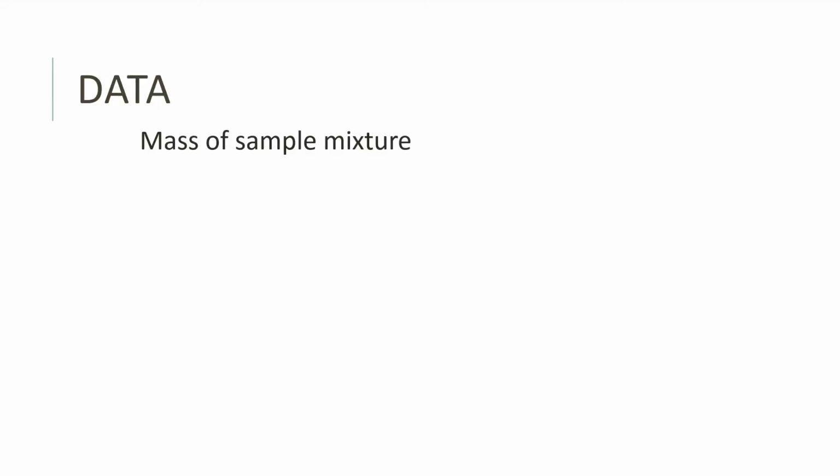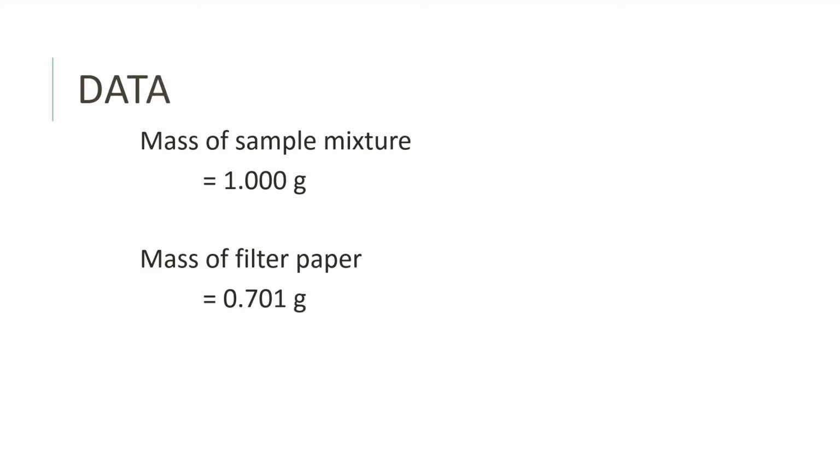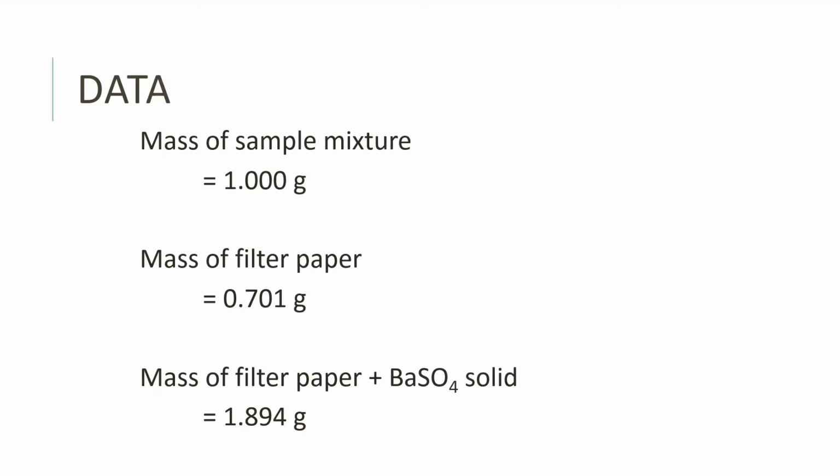Data. This slide shows the important measurements needed when doing our calculations. The mass of the sample mixture, filter paper before filtration, and dried filter paper and the barium sulfate solid.